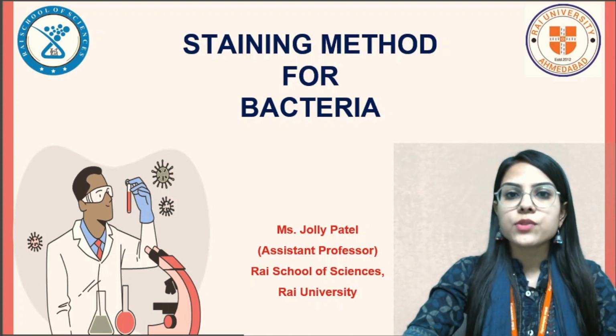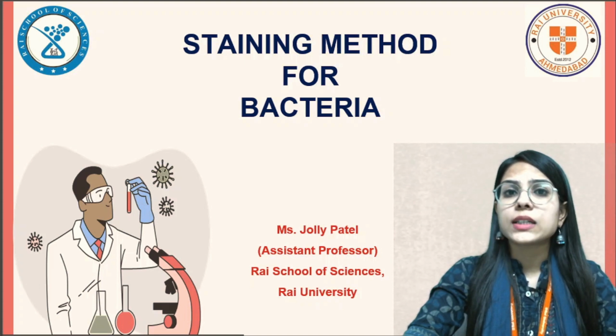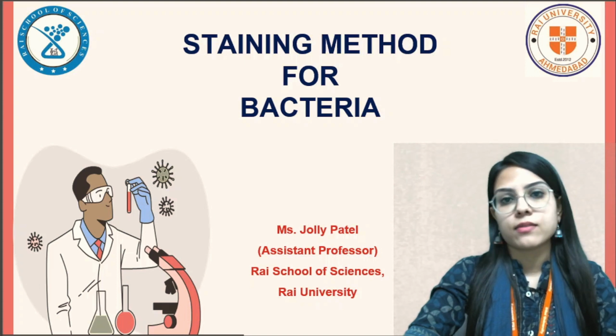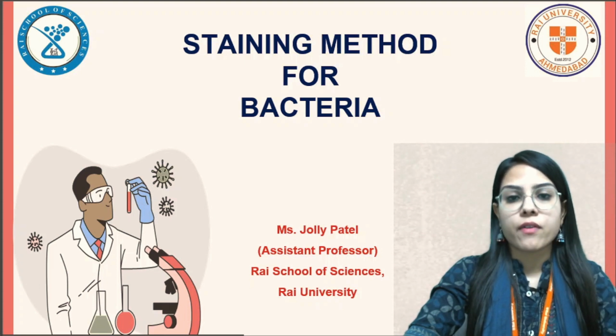So we can use the microscope for visualization of bacteria. But what about color contrast, because bacteria are colorless in nature? So how can we overcome this problem? The solution to this problem is a staining method. Through the staining method, you can visualize your bacteria through color contrast. So let's start.